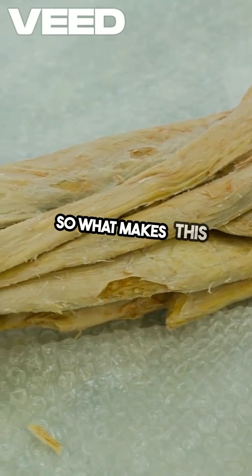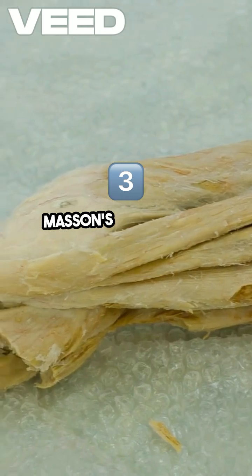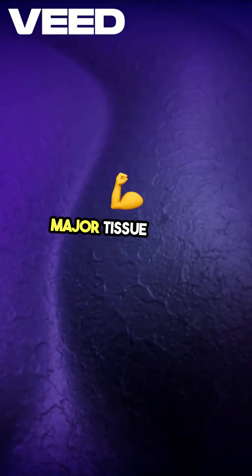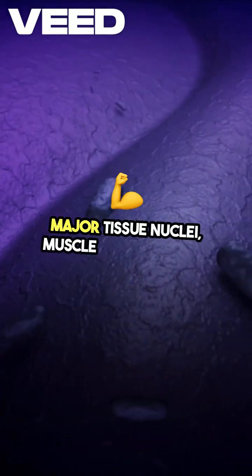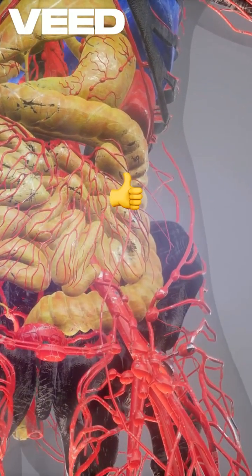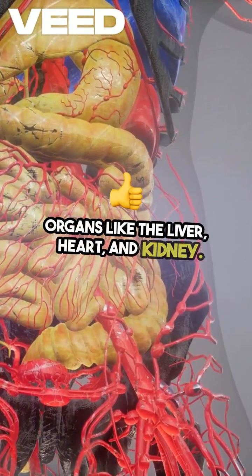So, what makes this stain so valuable? Masson's trichrome is designed to differentiate three major tissue components: nuclei, muscle, and collagen. It's especially useful in detecting fibrotic changes in organs like the liver, heart, and kidney.